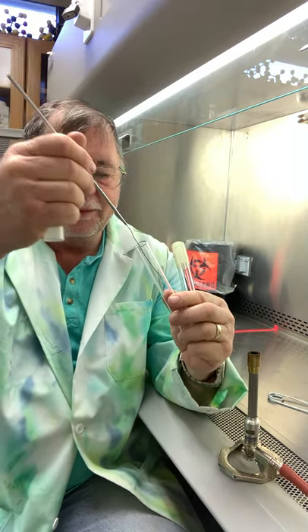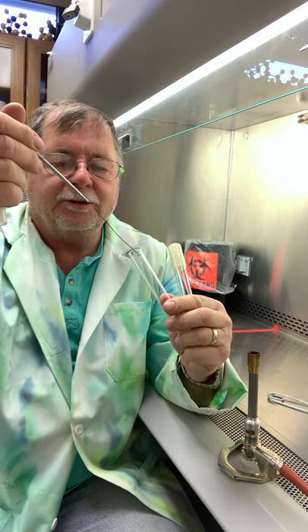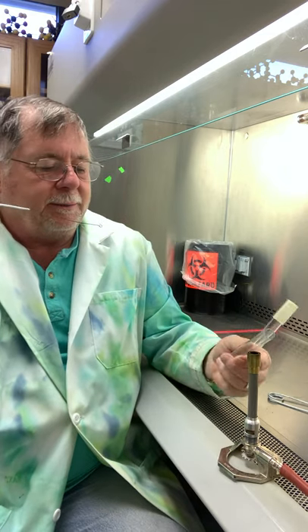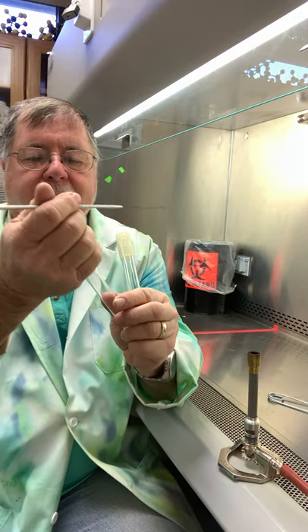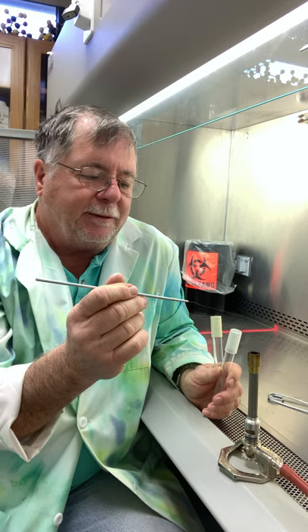If it's a liquid broth, we'll just go in there and do that, and then come out, make sure we're in the center so we don't flick, and then we'll flame it like this, or we'll flame it like this, and then we'll put the lid back on. And then before we're done, we have to heat this up.